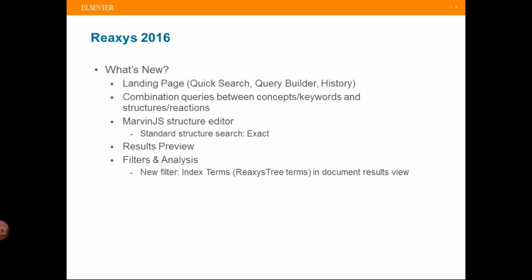So what's new, if you are looking at the new Reaxys, is a new URL. Sometime in mid-2017, we believe we can switch most of the folks to this new interface. We understand that takes time, convincing a pretty established user base that this newer interface is going to provide more benefit. So really, the landing page is new. Marvin JS structure editor.